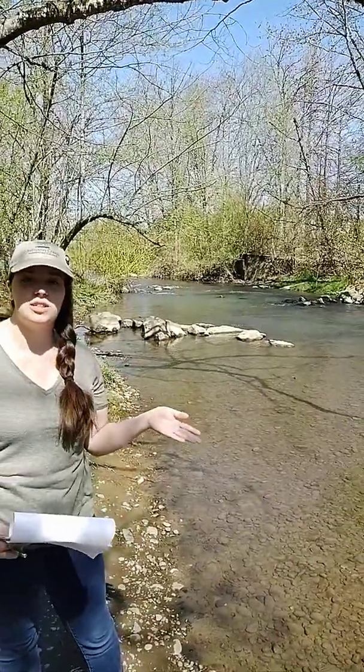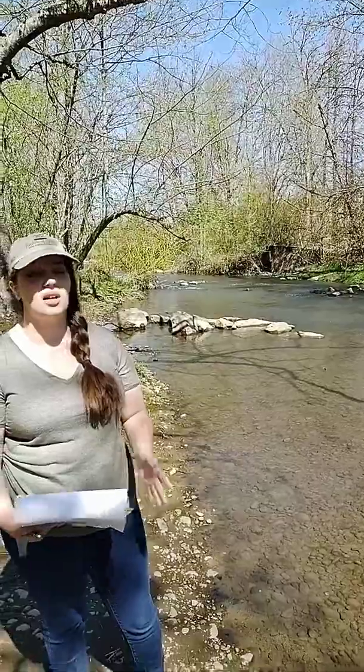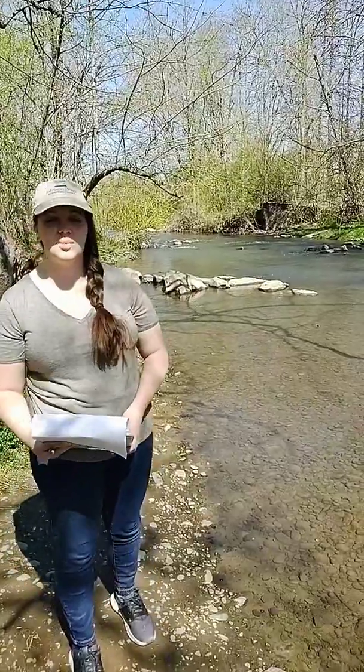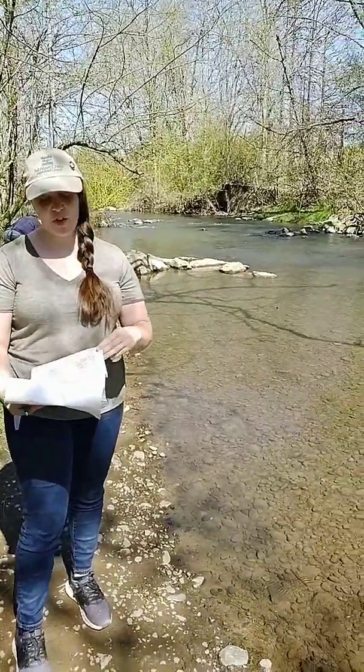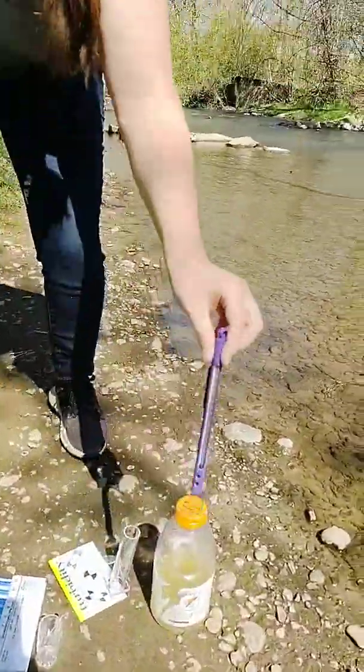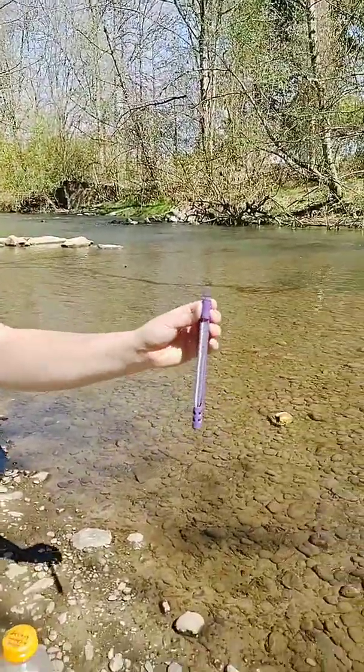Especially since we're so close here at Johnson Creek Park to the confluence where the Willamette is. So yeah, that's kind of a little background on water quality testing. Now we're going to get into more of our specific tests. The first one we're going to do is temperature. We're going to use this little temperature probe here.